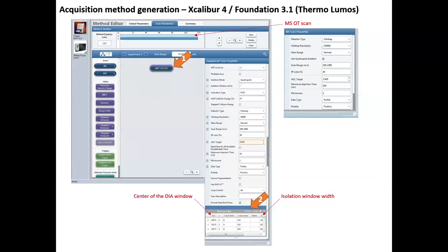So these are the types of parameters. If you want to go back, I think I sent a PDF to Ben, so you can have a look. These are the standard parameters that we use at the moment on our instruments, just to give you a starting point.